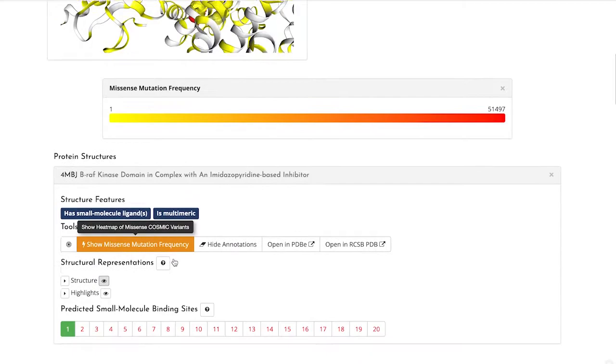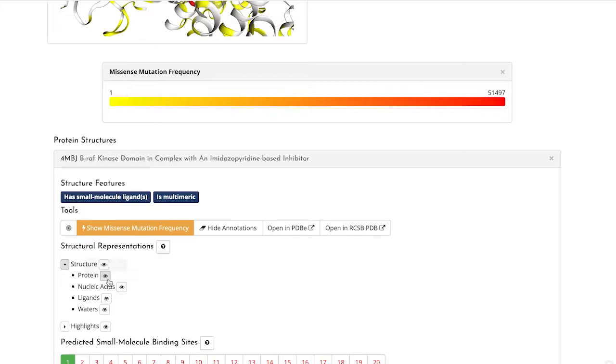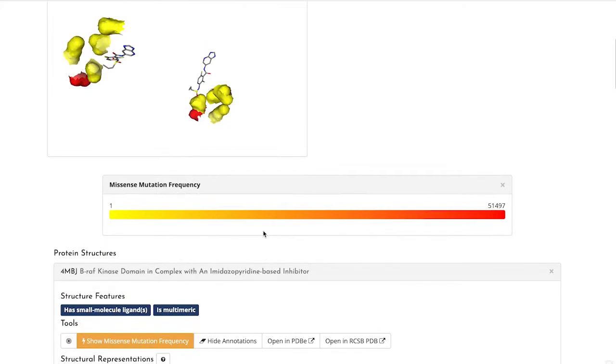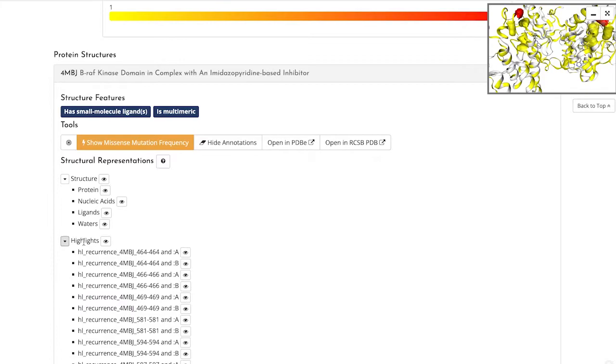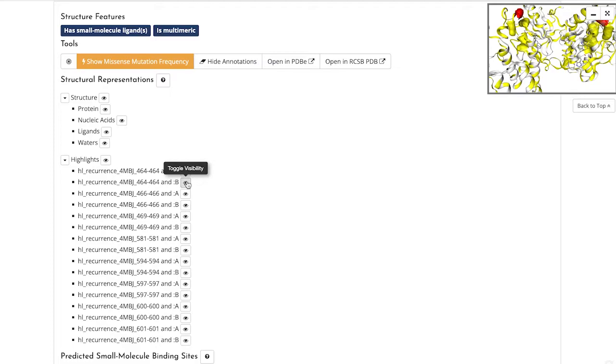If you're looking to specifically see how these highlight mutations may be interacting with ligands, you can switch on or off different aspects of the view using these switches. You can also turn off the highlights and just see the structure by turning off their visibility using the little eye icons next to each one.